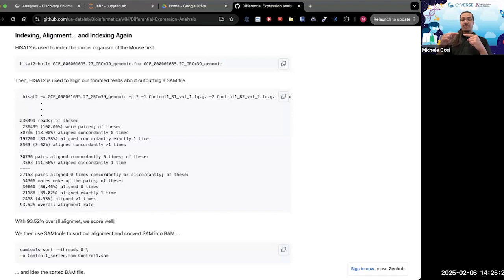And there may be some reads that would benefit from being on a different group. And therefore, the alignment still happens. The percentage will still be somewhat the same, but the change will be extremely small. But again, it is up to you to define if that minuscule change is important to you or not.